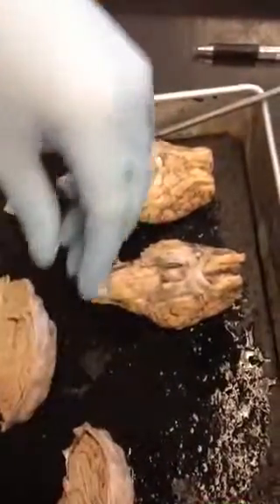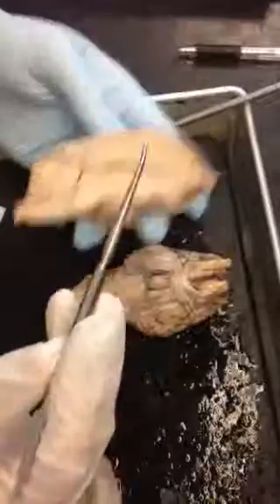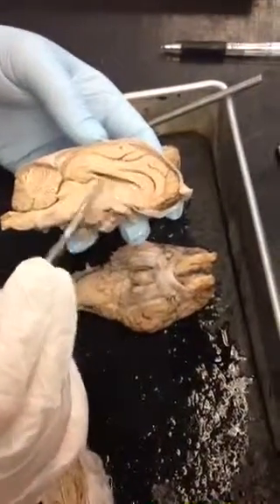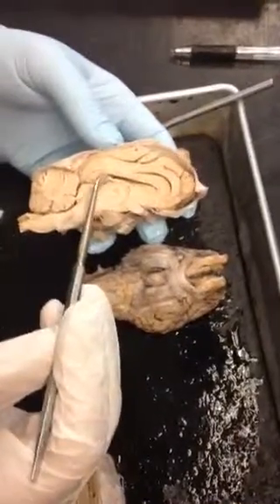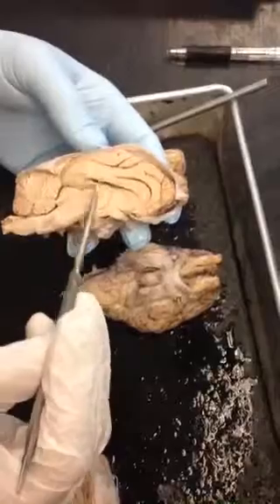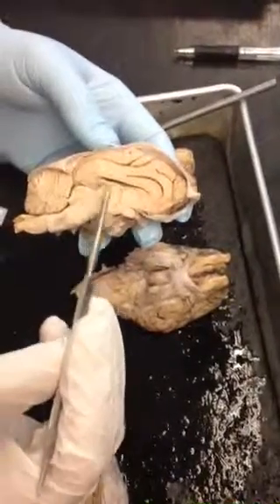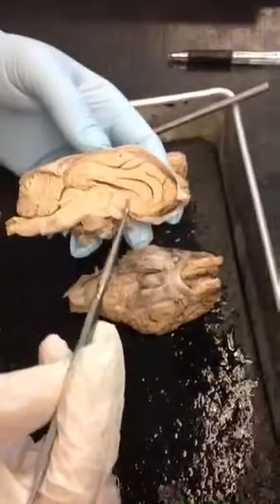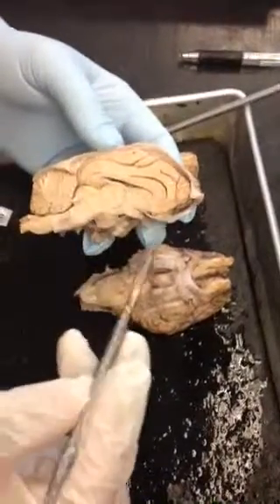So identifying the internal structures. What's this part right here? The lateral ventricle. Yeah, it's a lateral ventricle. And so the top, or the ceiling of the lateral ventricle, would be the corpus callosum, and then the floor of the lateral would be the fornix. Right. So the floor is the fornix.